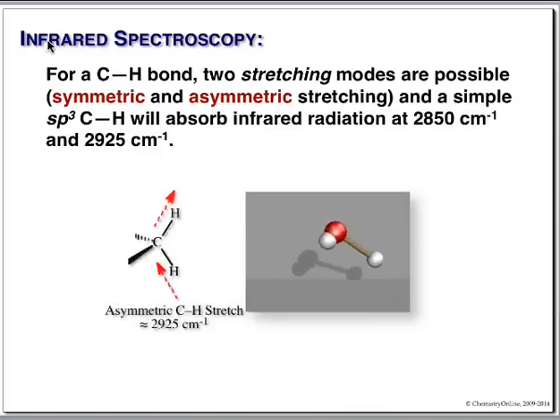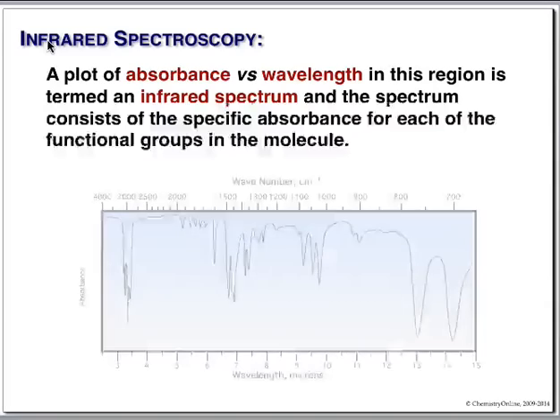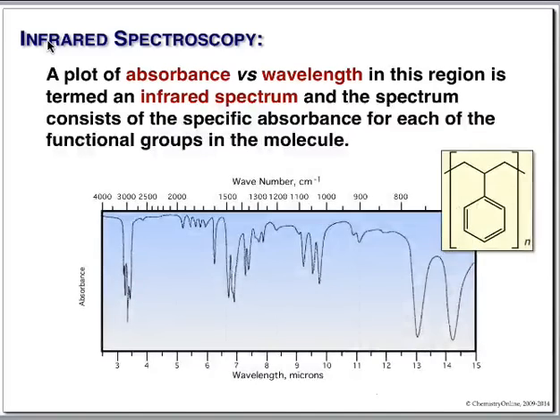Let's look at the spectrum we started with. This is polystyrene. When you do simple infrared, you have to calibrate your machine, and a polystyrene film is very often used. And this little peak right here occurs exactly at 1601 reciprocal centimeters.